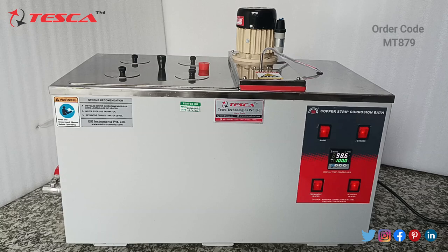You can see the temperature is 98.6 degrees Celsius right now, and look carefully, the vapors are coming out. When the water is at 98.6 degrees Celsius, it will increase very slowly after 98 degrees Celsius. From 98 to 100 degrees Celsius, it will take time. You can see the vapors, which means the water starts boiling. It got close to 100 degrees Celsius, so it starts boiling. Now let it remain for 2 hours, and then we will check the copper plates by taking them out.